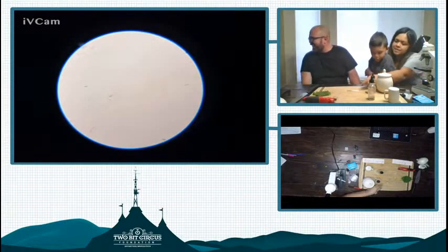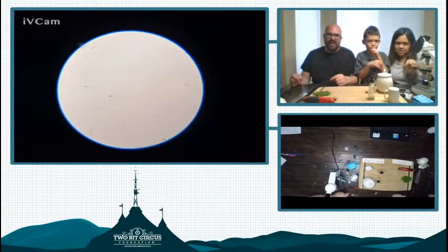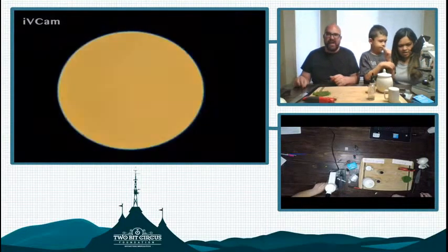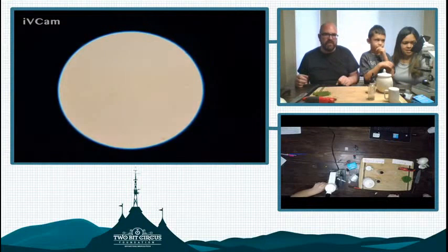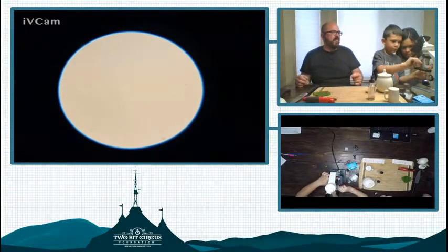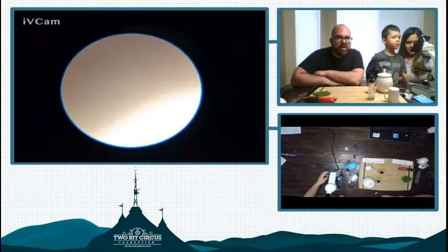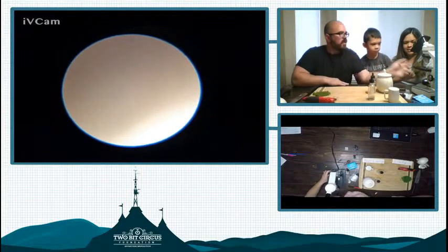Yes, exactly. And then Ian, back in our days, we used to wait in line to see what was under the microscope that the teacher was showing us. Now you could just display that for the world, kind of like we are doing here today. And then Robert, remember, you always start with the lowest magnification. Start with the lowest, and then you bring the stage up.